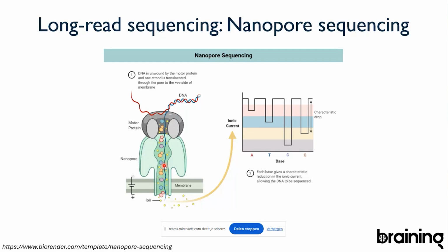It's not so different from what you would have with an ion channel. And so basically here in the surrounding of this pores, there are electrolytes. And so basically you have some kind of ion current that goes through the pore. So if the pore is empty, you would have a basic ionic current that's going through the pore, right?